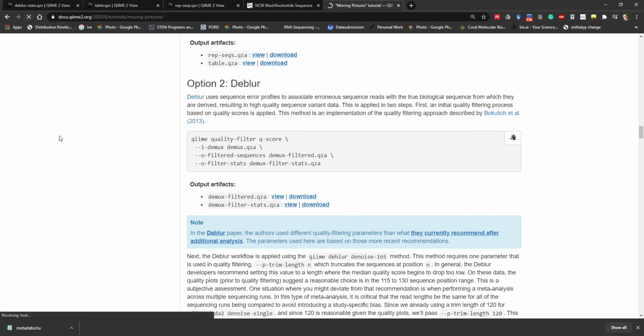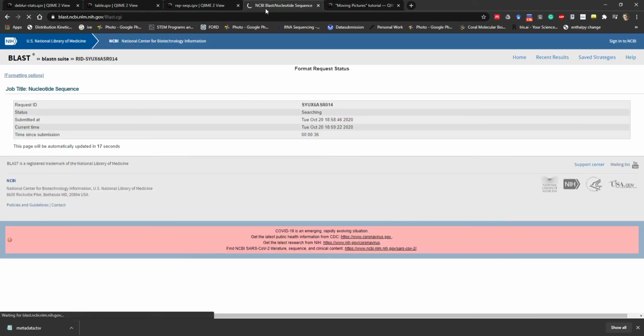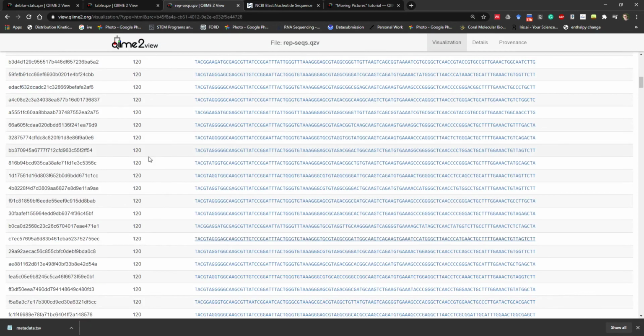Just make sure it's not my internet. Okay, well that's taking quite a while. I'm going to come back to that later if we need to.